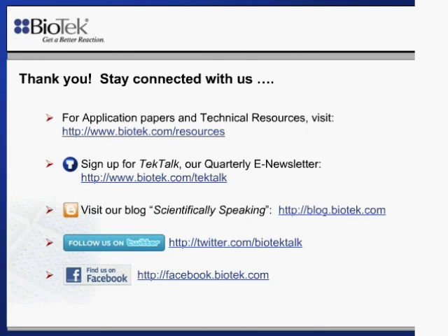That's going to depend, of course, on what assay we're looking at. Most of the work that I presented today was simple absorbance measurements at either 260 or 280 nanometers, until we get into the in situ type assays. One of those used a colorimetric dye for the BCA assay, whereas the Pico Green assay does rely on a fluorescent dye.